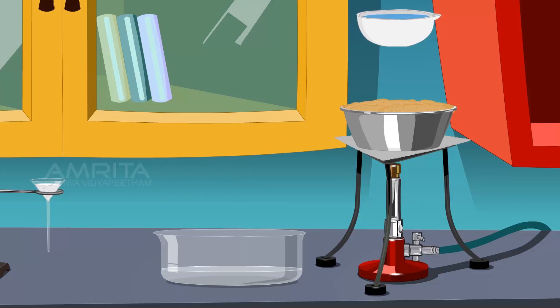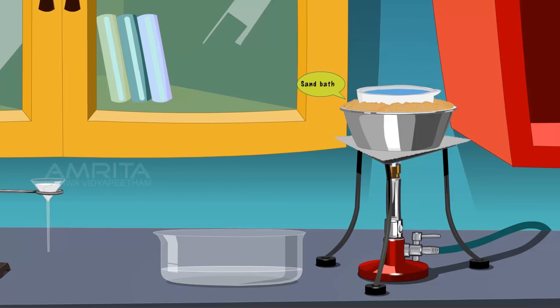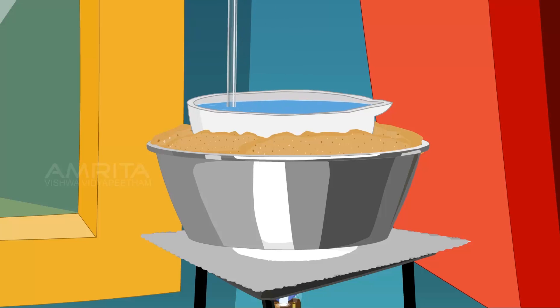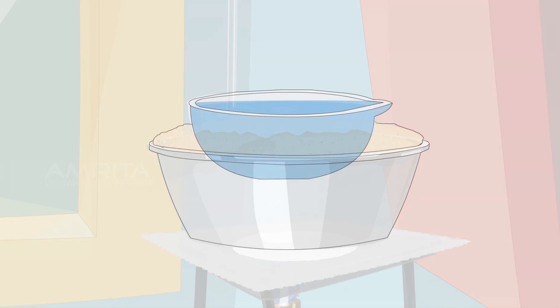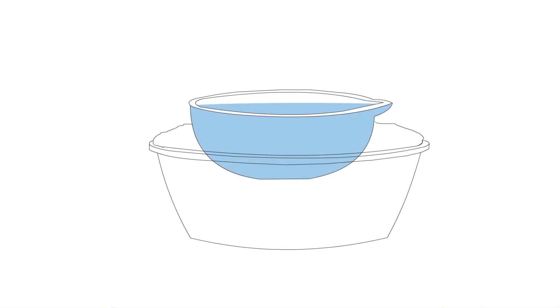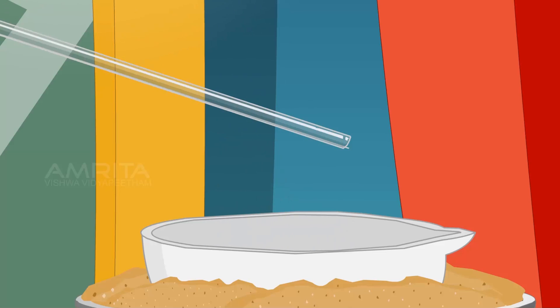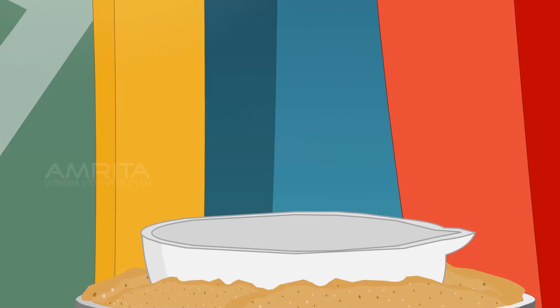Heat the solution in the china dish on the sand bath while stirring using the glass rod to avoid crust formation on the sides of the dish. Don't allow the solution in the dish to boil. Continue heating till the solution is reduced to about one third of its original volume. Take out a drop of the solution using the glass rod and cool it by gently blowing on it. The appearance of tiny crystals on the glass rod shows that the crystallization point has been reached.